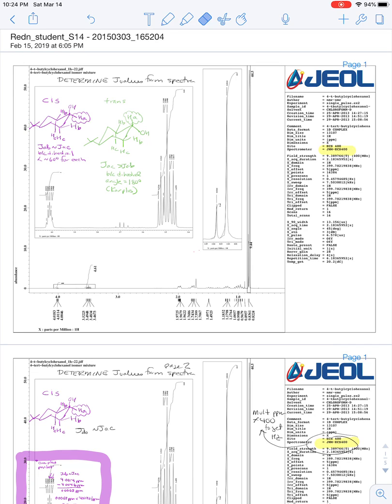Here's a spectrum taken by students a couple semesters ago of the mixture of cis and trans alcohols from the reduction, and our mission here is to determine the J values from the spectrum.